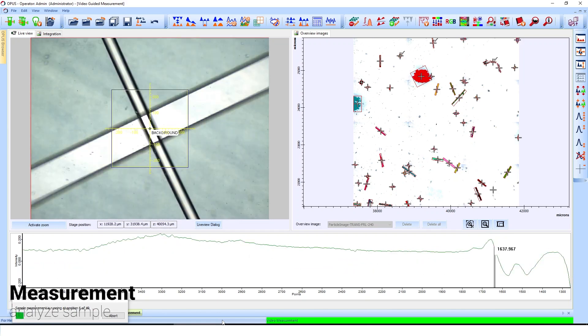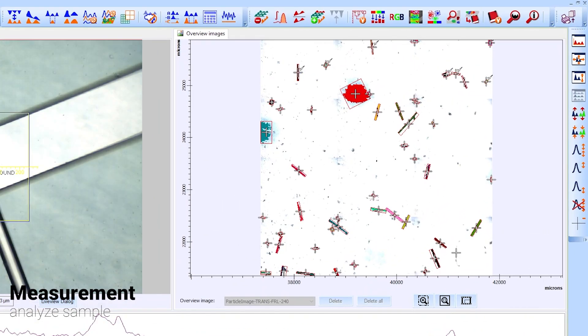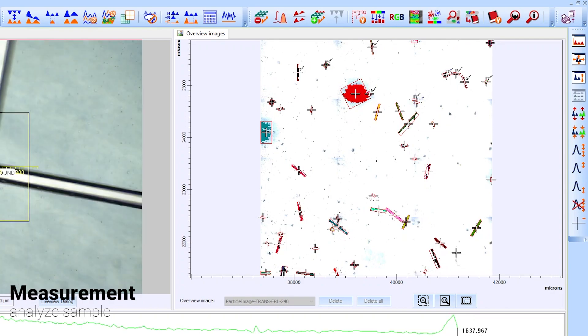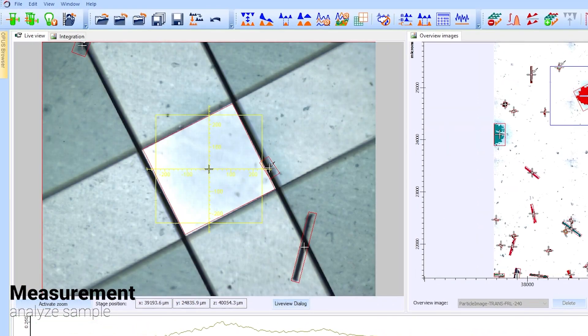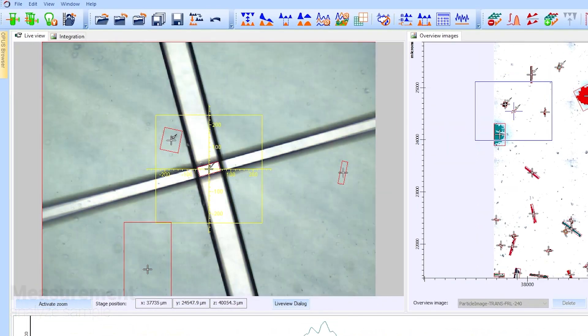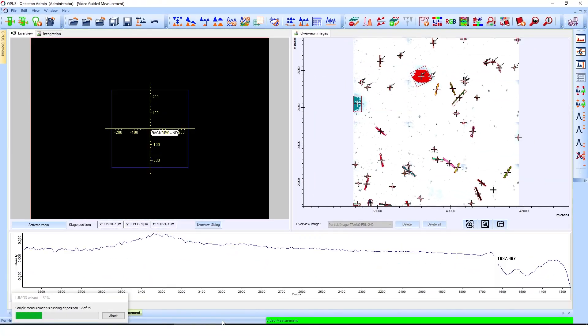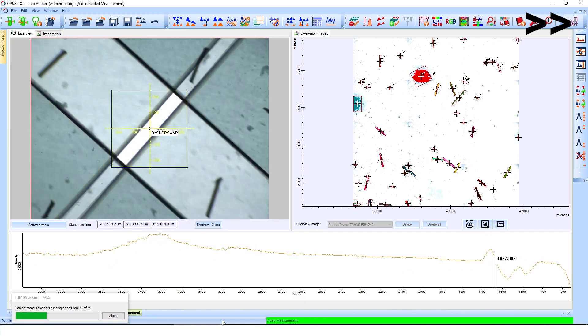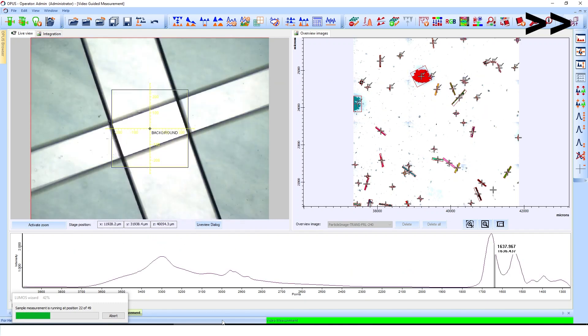The Lumos will now approach each measurement point, adjust the aperture to match the particle, and record an IR spectrum, again completely automated.